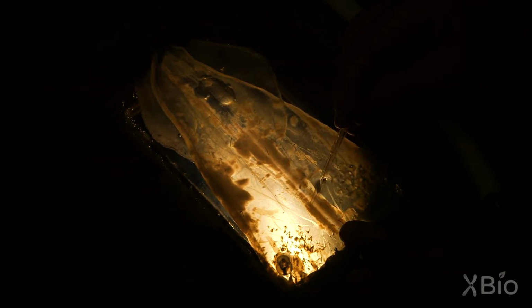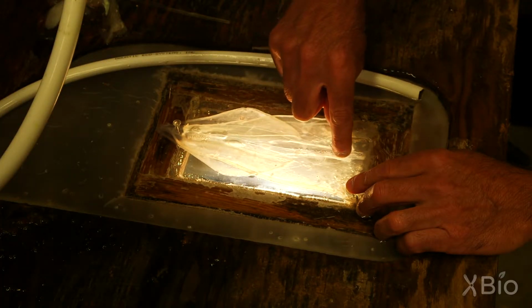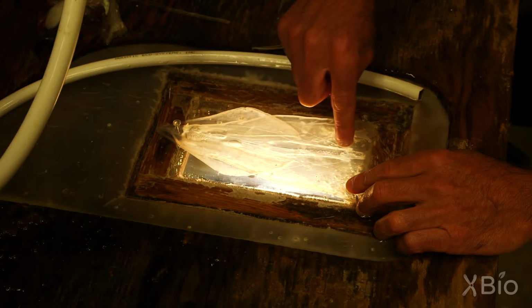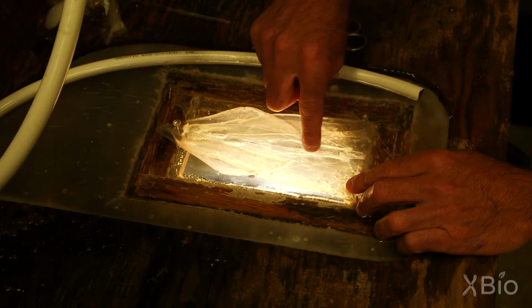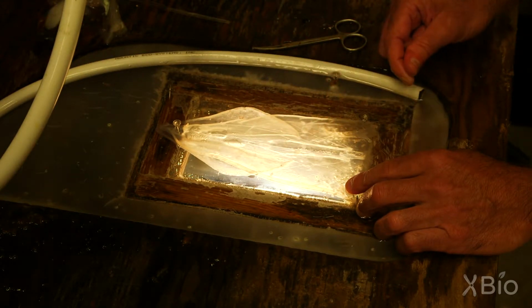And the biggest of these axons is the squid giant axon, and it lies right along the pen, right in the middle here. So this is the axon that we're going to have to dissect out, and there's one on either side here. So the next step is to dissect out that axon. We had to very carefully get the giant axon, tie it off, remove it from the squid. And here we are removing the giant axon, and also kind of a protective sheath that is covering it.